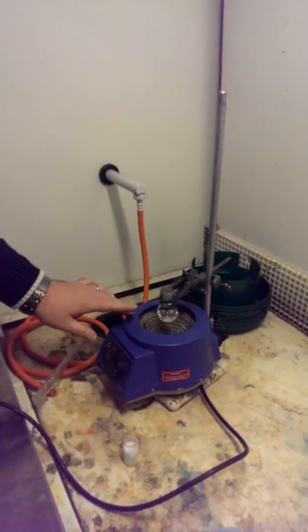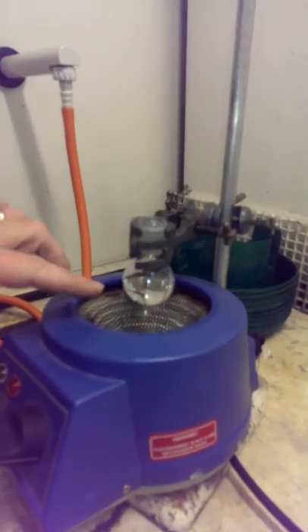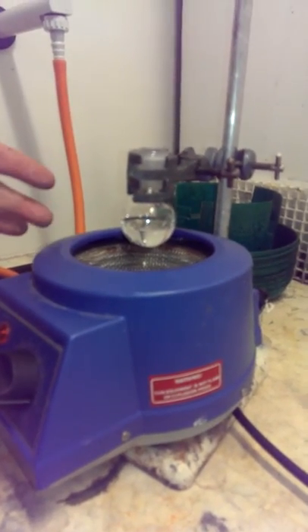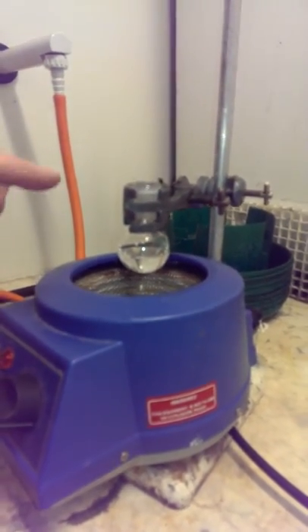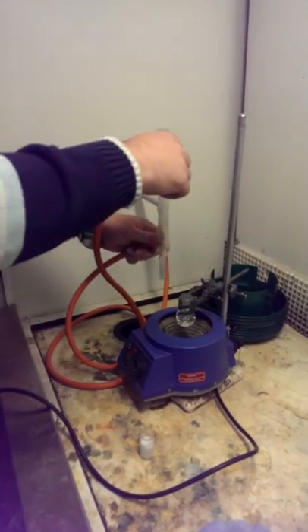Just to return to a point about the flask, if you're refluxing or doing any work with a flask, make sure it's no more than 2/3 full. A 10ml flask contains 5-6ml of solution, not 8 or 9ml. That's too much, so no more than 2/3 full. Get a condenser and put it into place.